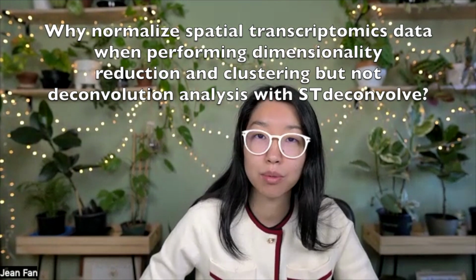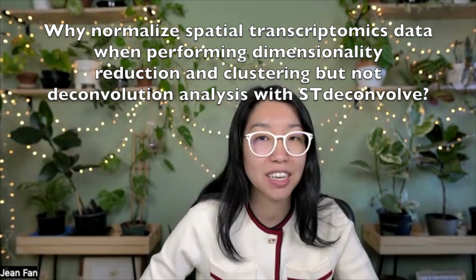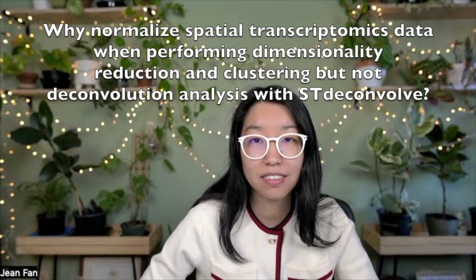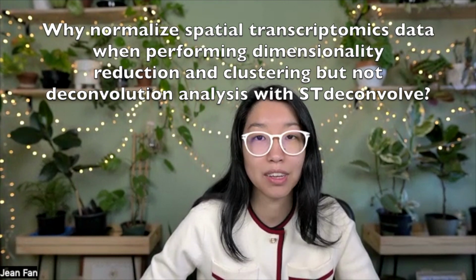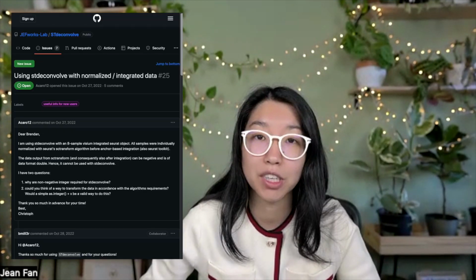Hello, I'm Professor Fan, and today I'll be live coding a series of spatial transcriptomics data analyses in order to explore why we perform normalization when doing dimensionality reduction and clustering analysis, but not when we do deconvolution analysis using our lab's tool STdeconvolve. So initially, this question was submitted through GitHub issues.